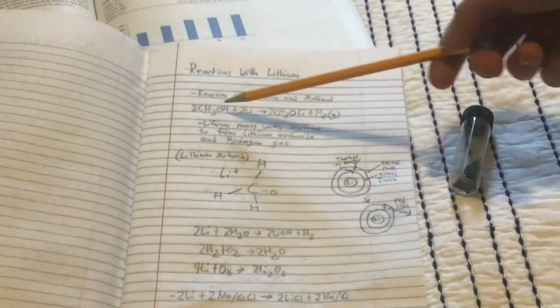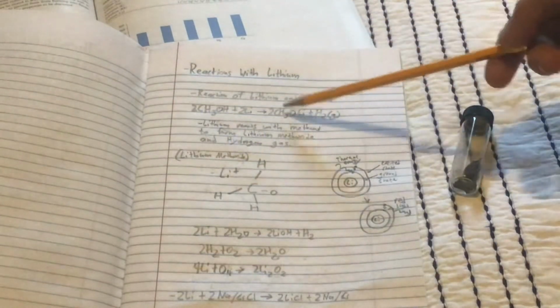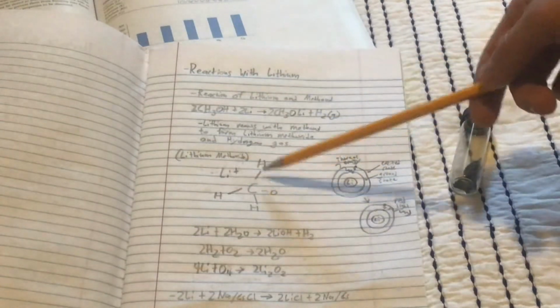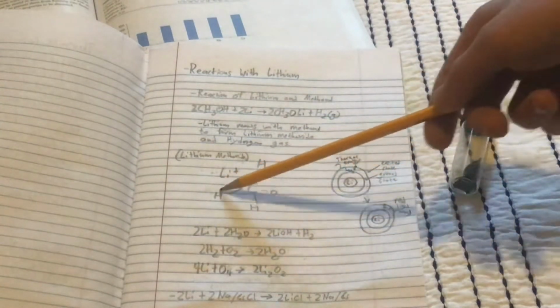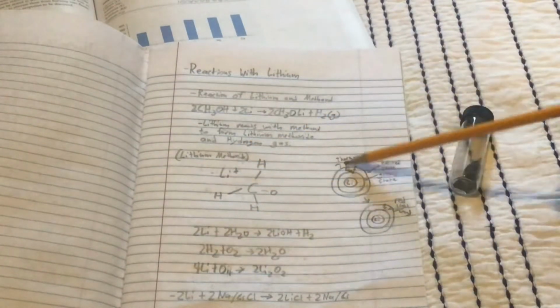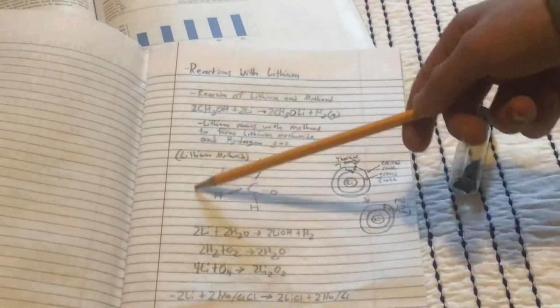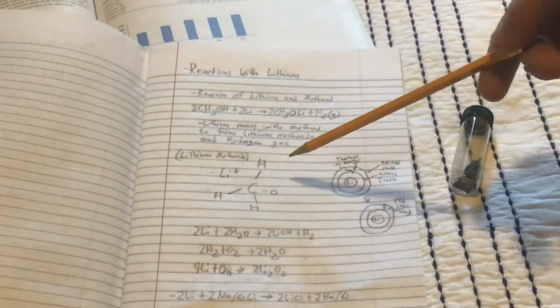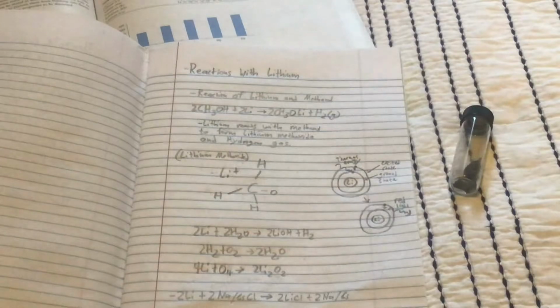Well, if we react lithium with methanol, we can create lithium methoxide and hydrogen gas. Now, when you burn lithium methoxide, the methoxide part of it actually is what's doing the combusting, but the lithium ion gets excited during this reaction and emits red photons. So it should burn with a really, really nice deep red color. So let's go try that out.